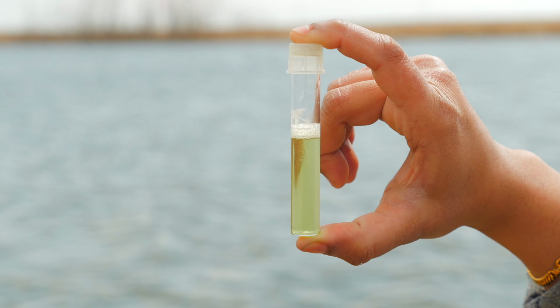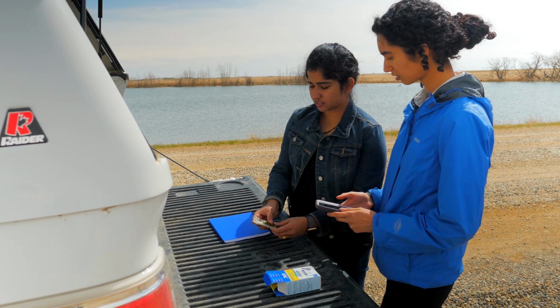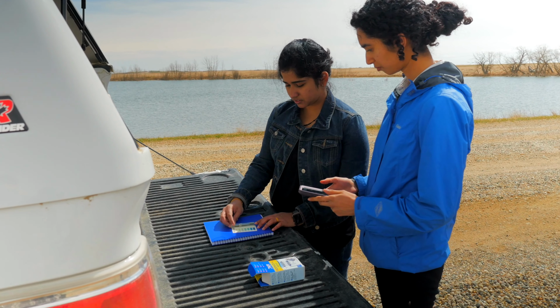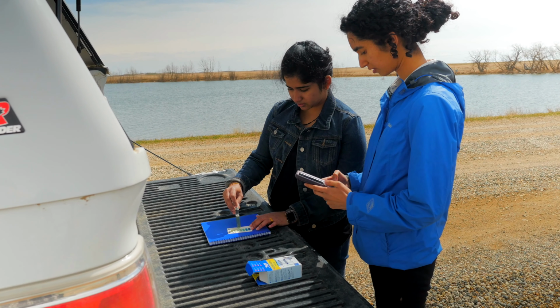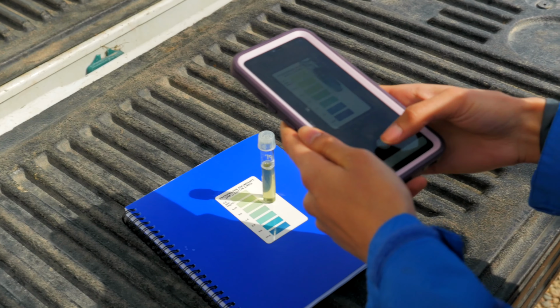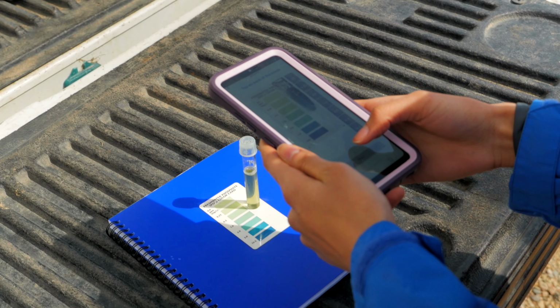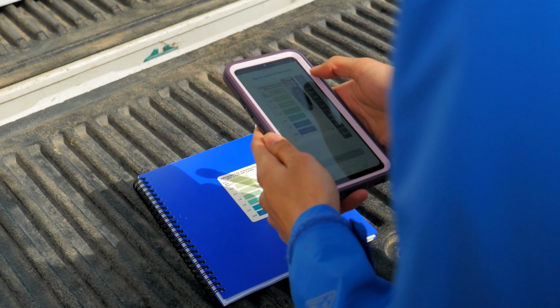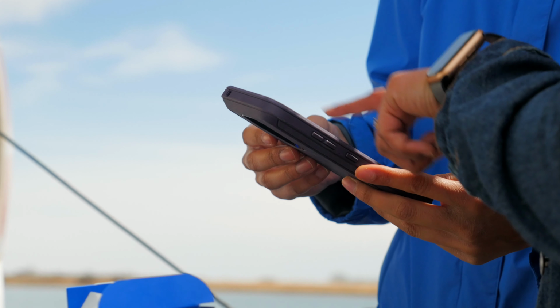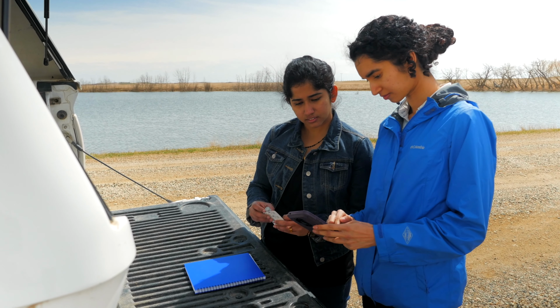Read the step-by-step guides in the app and test kits carefully on how to take the photo to obtain the best results. Once you have taken an image of the test, follow the app instructions to obtain an estimated concentration of either nitrate or phosphate. These results will then be stored in your phone and you will be given the opportunity to share them online. You can visualize your measurements in a geo-referenced map in the app or through the app's website.